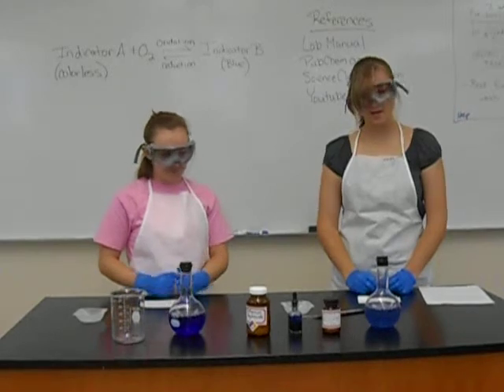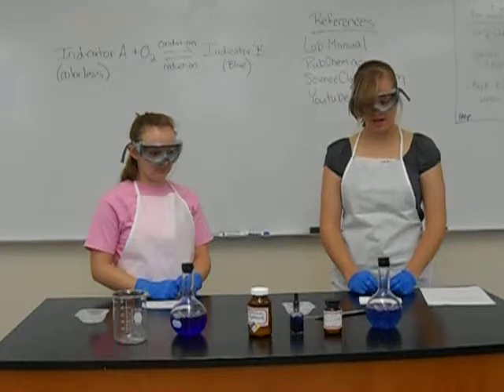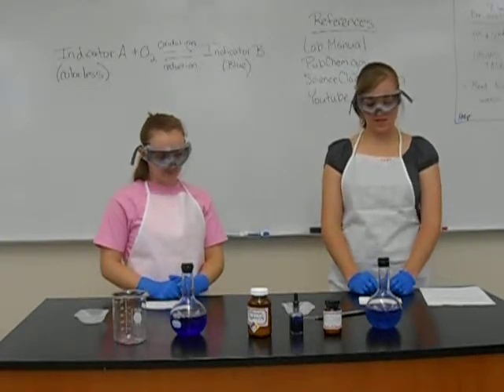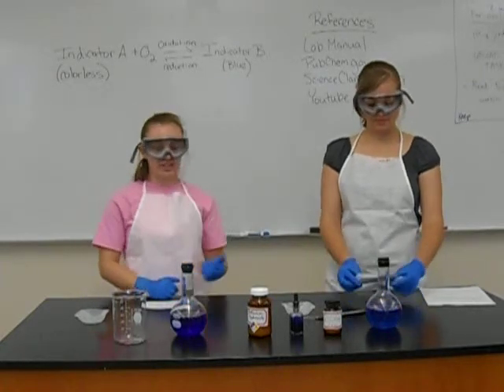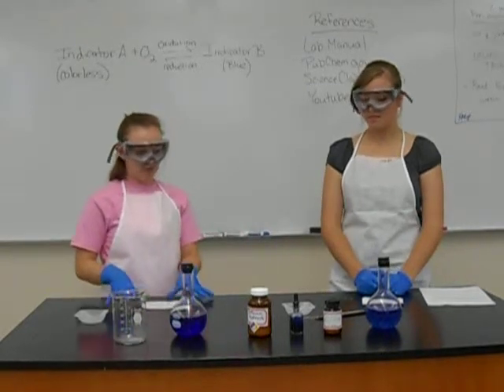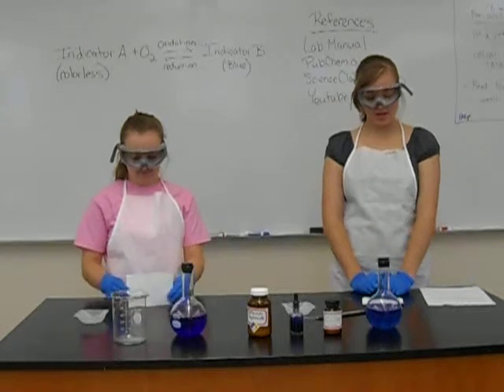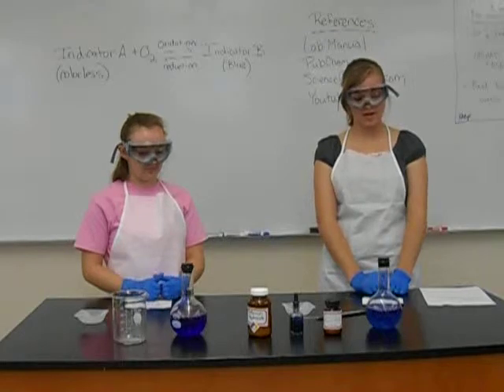So the results show that the oxygen present in the flask undergoes oxidation, which is when oxygen is gained and the electrons are lost. So this transforms the methylene blue dye to its original color. Also, the basic properties cause the dextrose to reduce the methylene blue to colorless. And swirling the solution reintroduces oxygen, so it reoxidizes the methylene blue back to its blue form. And this can be done as long as there's oxygen in the flask. Because of the oxidation, the methylene blue turned to its original color. In order for the colorless reduction to occur, the electrons are gained.